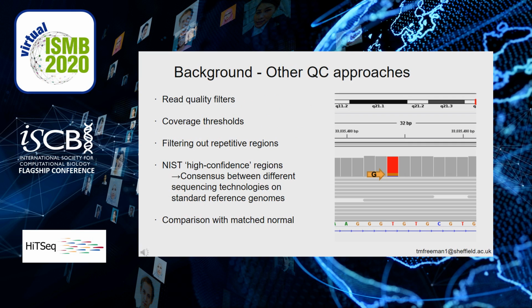To provide further background to this problem, we also need to ask whether existing quality control processes can correctly identify and remove these false positive sequencing results from our data, because otherwise our method wouldn't provide much additional value. The methods listed on the left can help with QC, but we have found that all of these are very limited in their ability to filter out systematic false positive variant calls and have other drawbacks, which our method addresses.